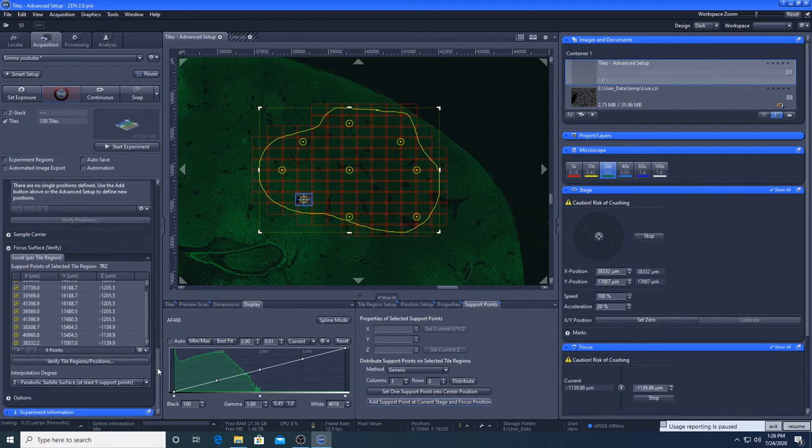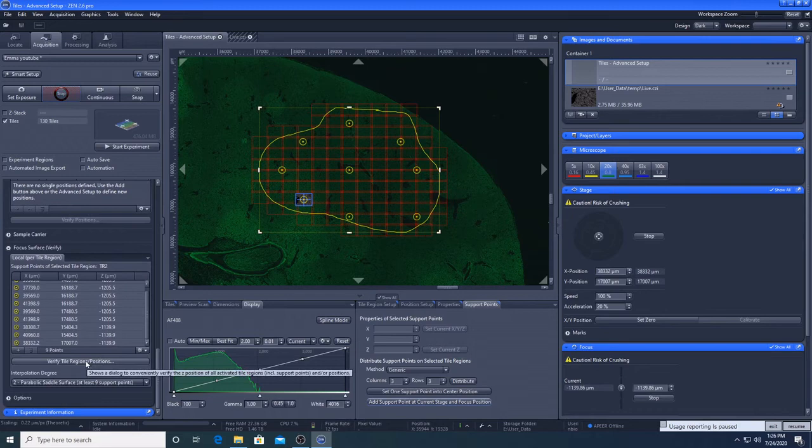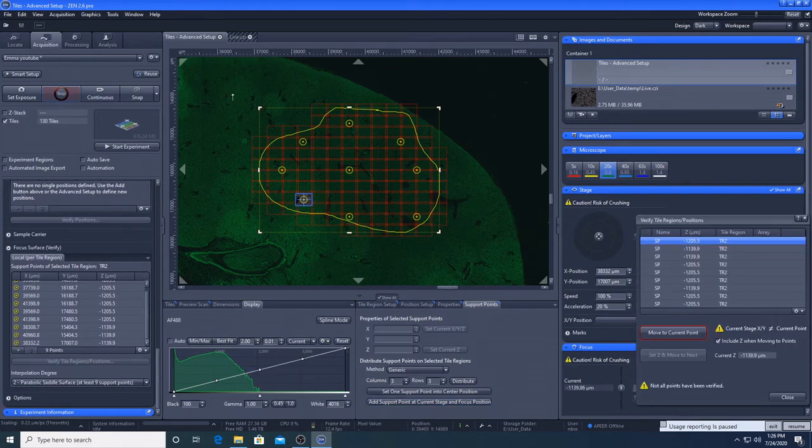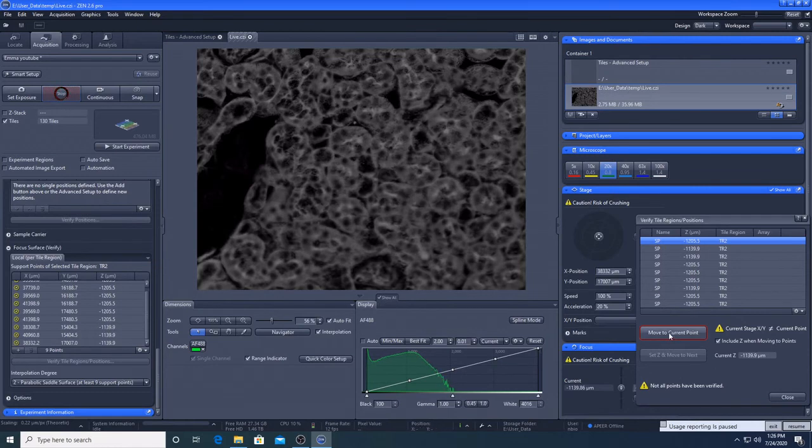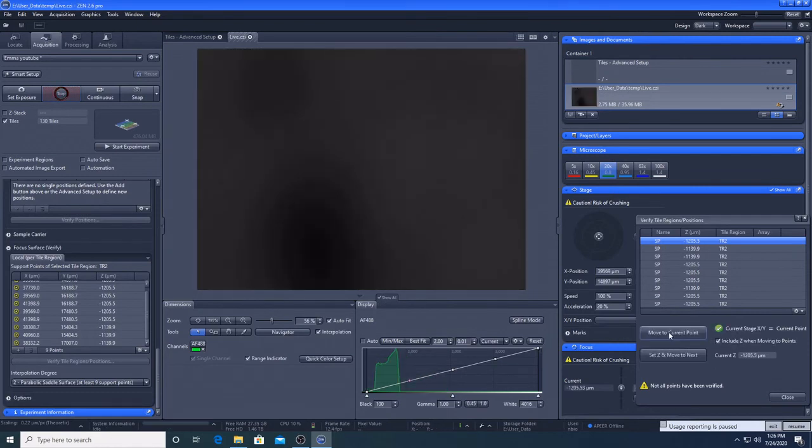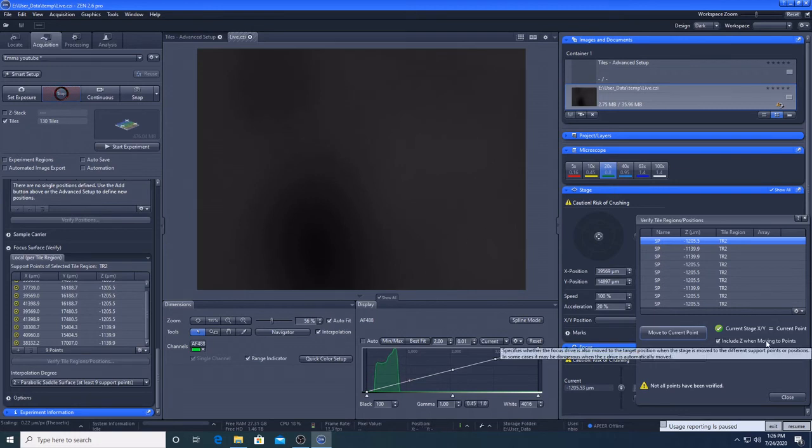So here we've got all our support points listed here. So we need to verify these and set the focal plane for each one. So we're going to verify these. So this comes up here. We're going to go to the live window. And then we're going to move to the current support point. So you can see it's massively out of focus. You need to make sure include Z when moving to points is ticked.